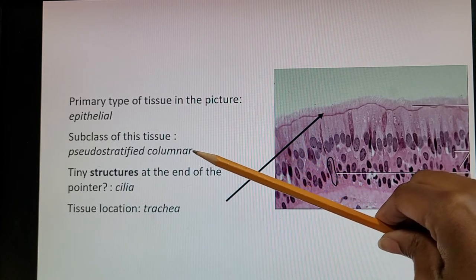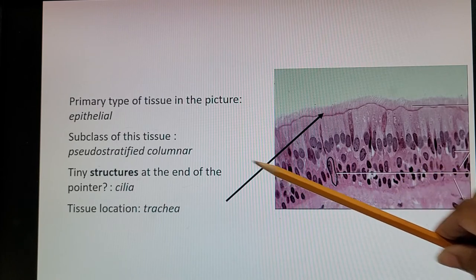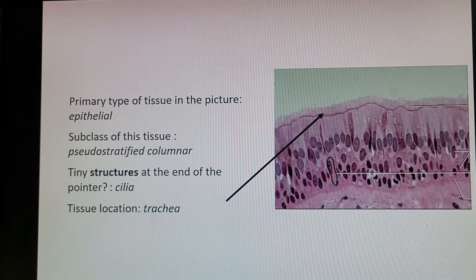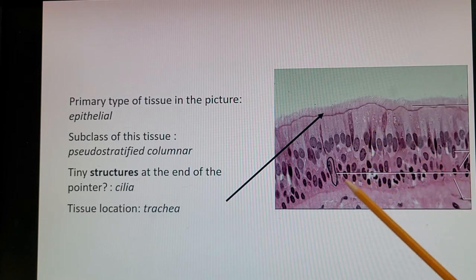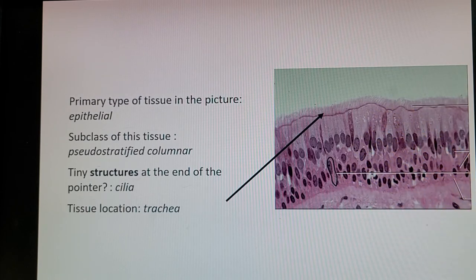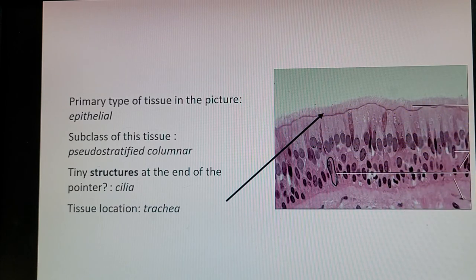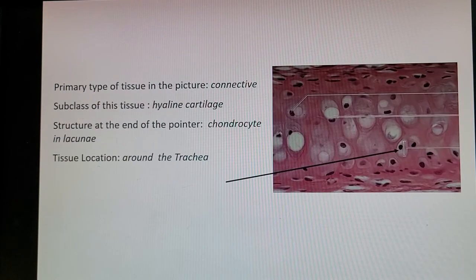Next is epithelial tissue with cells aligned on a basement membrane. This type is pseudostratified columnar: the cells have multiple layers but all touch the basement membrane, even though they look stacked. The tiny structures at the end of the pointer are cilia — long cell extensions off the cell. The location for this tissue is the trachea.